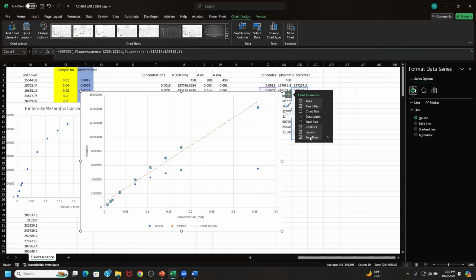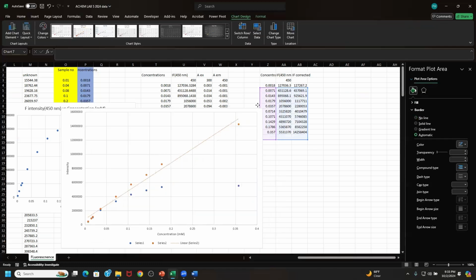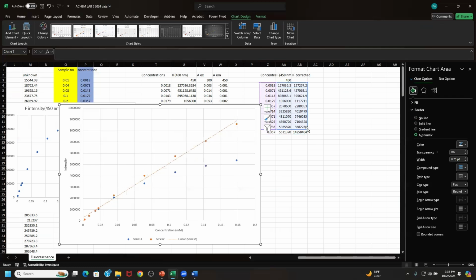I think due to experimental errors and maybe inaccuracies or concentration losses in the UV-Vis measurements, this is not that linear. Otherwise it should be perfectly linear with your sample. You can see that if you remove one data point from here, you can clearly see the linearity of your measurements.